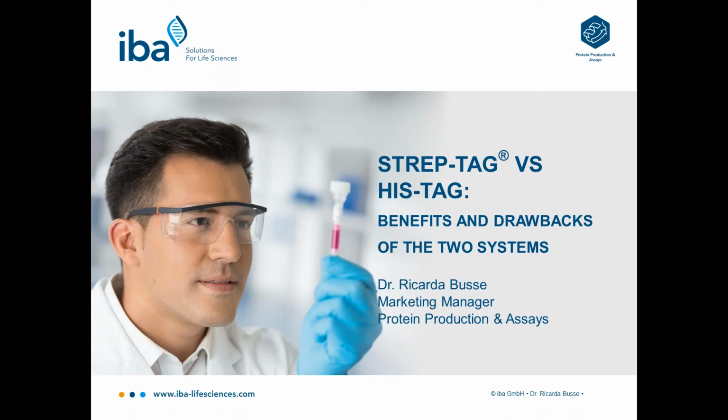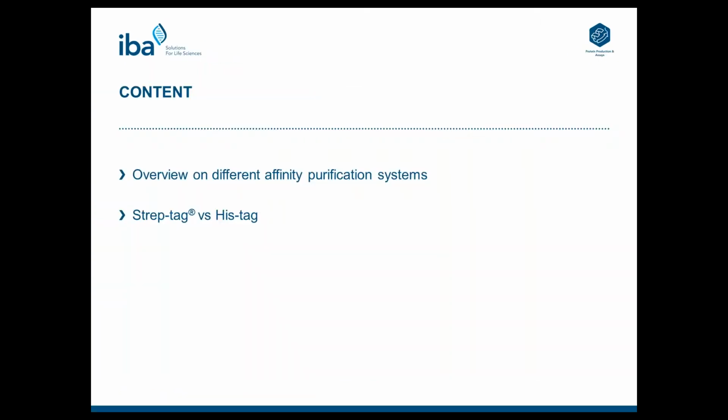Welcome. My name is Ricarda Busse, and in this presentation I will compare the Strep-tag with the His-tag and point out the benefits and drawbacks of these two purification systems. At the beginning of the webinar, I will give you a short overview on the available affinity purification systems based on peptides and proteins, and then we go into the details of the Strep-tag and the His-tag systems and compare both systems with each other.